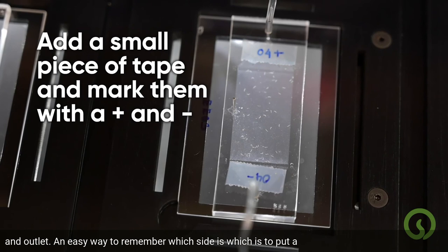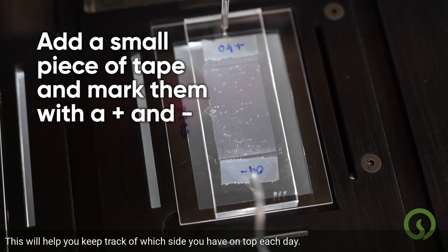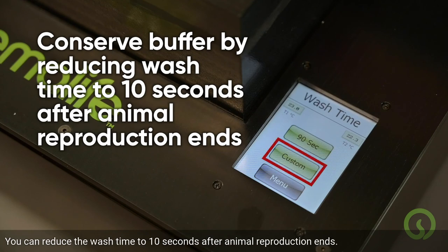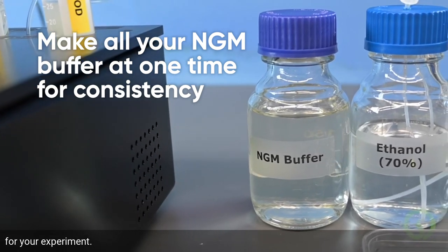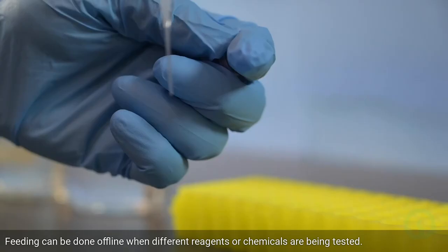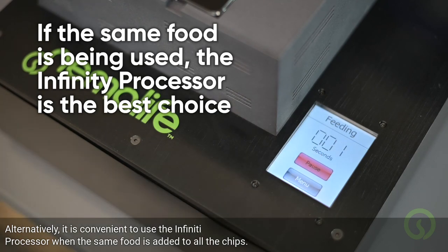An easy way to remember which side is which is to put a small piece of tape on either end of the chip and mark them with a plus and minus sign to keep track of which side you have on top each day. To conserve usage of buffers during lifespan experiments, you can reduce the wash time to 10 seconds after animal reproduction ends. For consistency, make all the NGM buffer bottles together at one time for your experiment. For larger scale experiments, use the 250ml bottles. Feeding can be done offline when different reagents or chemicals are being tested, but it is convenient to use the Infinity processor when the same food is added to all the chips.